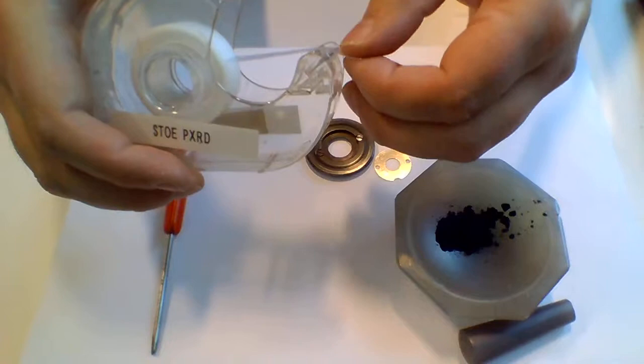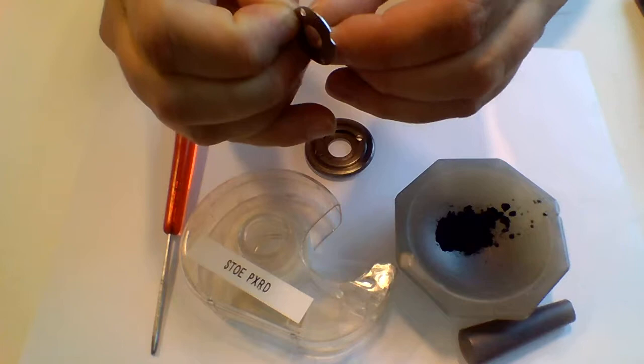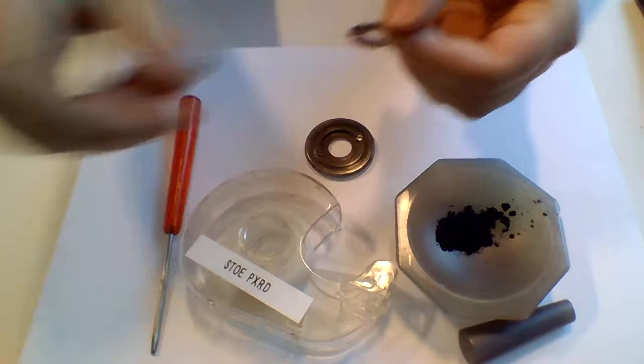So you take an appropriate sized piece and stick it to the ring. And now you have a sticky surface here. You simply take a small spatula.